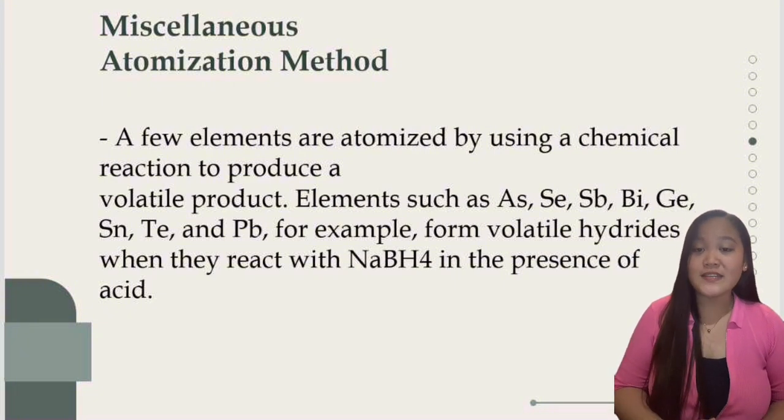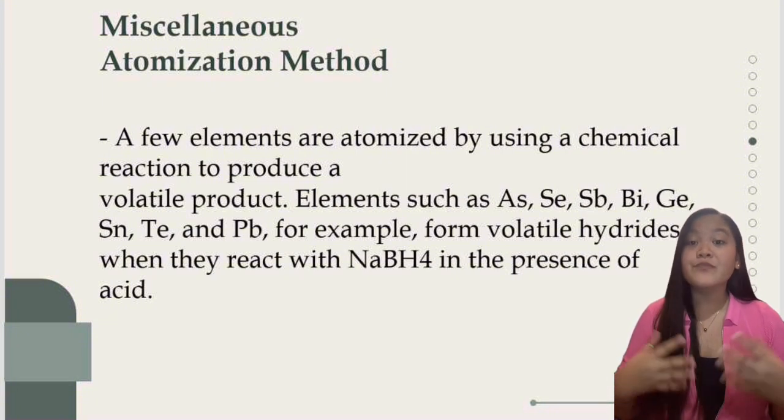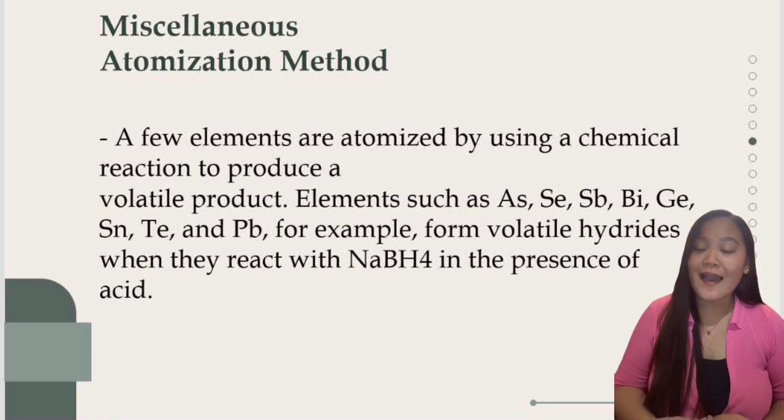So this hydride is special because it readily evaporates, becoming a gas. We can then carry this gas with an inert gas like helium into a hot flame or a heated tube. So inside the hot zone, the hydride breaks apart, finally releasing our element as free individual atoms.